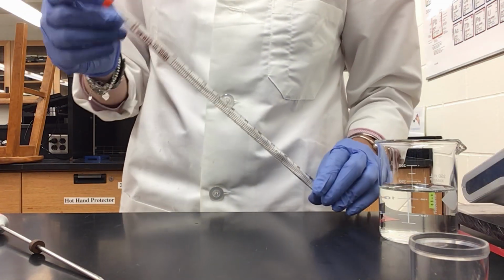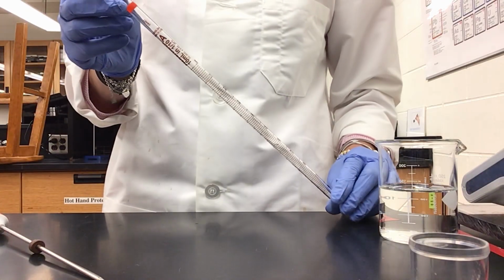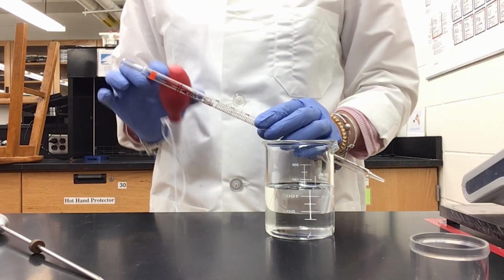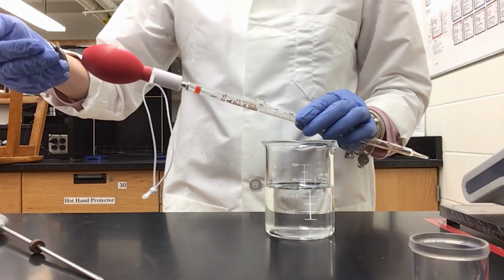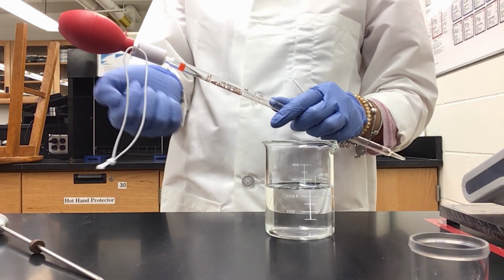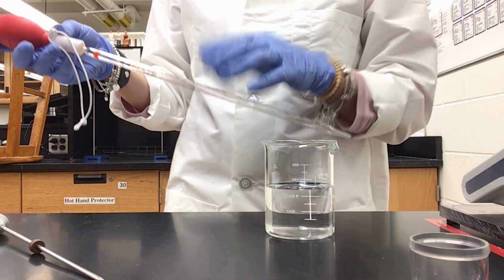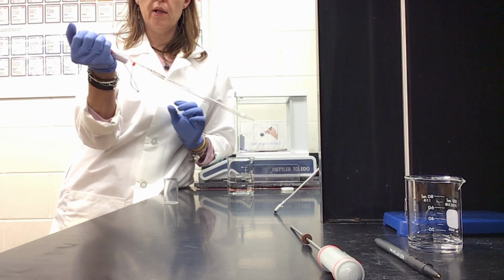So for this experiment, we are going to use not the serological pipette that you have in the trays, but this special glass pipette that is provided to you only for this experiment. Okay, so how do you use a pipette in general? You need a bulb that you need to put here, okay? You don't need to shove it inside, it just needs to be firm so that it doesn't fall, but not completely pushed down, okay? So the contact is needed because you need a sort of vacuum, otherwise when you suck the water or anything that you might want to measure, it's not gonna come up properly.